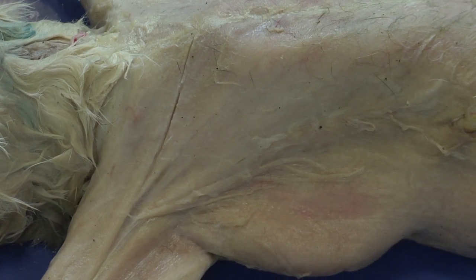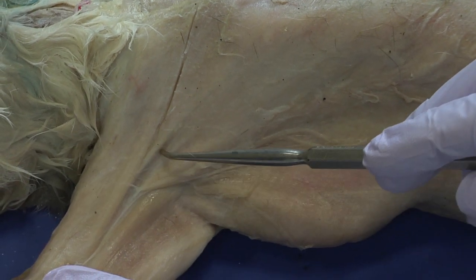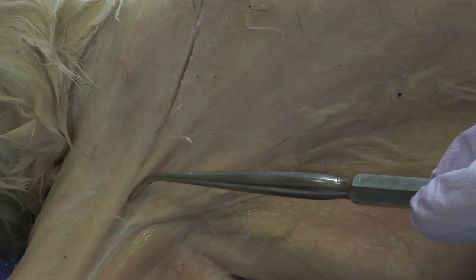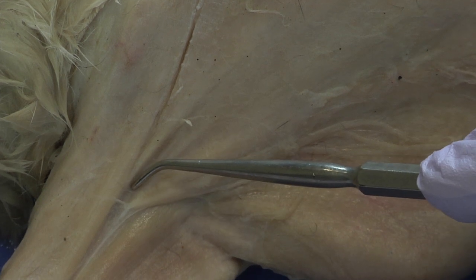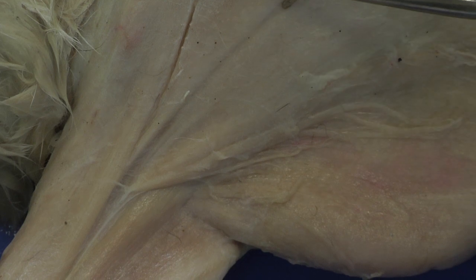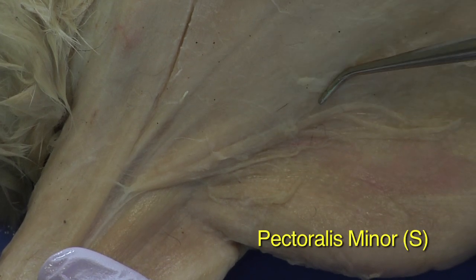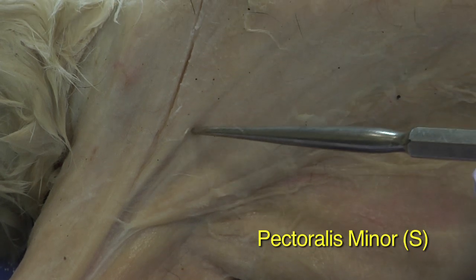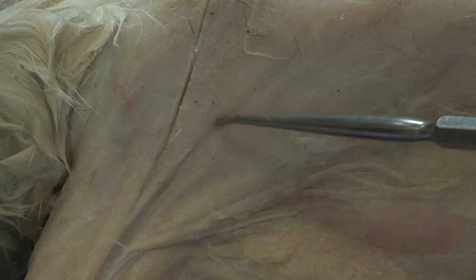Using the probe, you can see these muscle fibers — there's a separation here. We're actually quite fortunate in this case: there's a clear separation visible because of the connective tissue between these two muscles. This is the separation between the pectoralis major and the pectoralis minor. This is the major, this is the minor, and you can see this line representing the boundary between those two muscles.